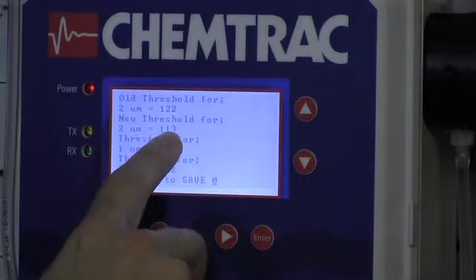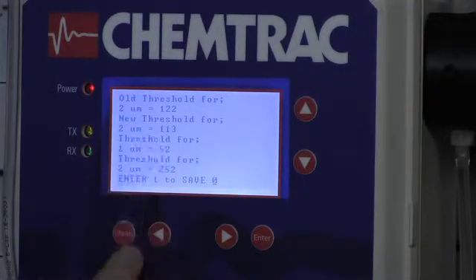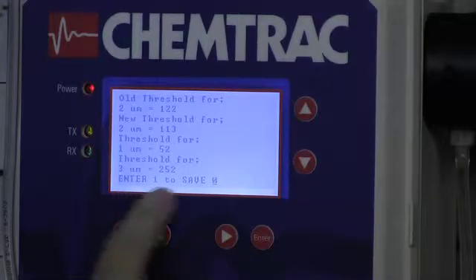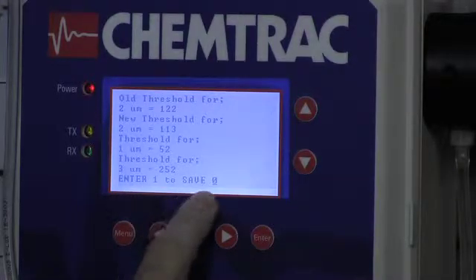What we want to make sure is that the 2 micron threshold never overlaps the neighboring threshold settings. If it did, then something is wrong with the calibration or the sensor. So now we're going to press enter. We're going to actually enter 1 to save.